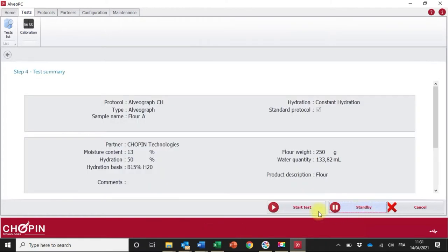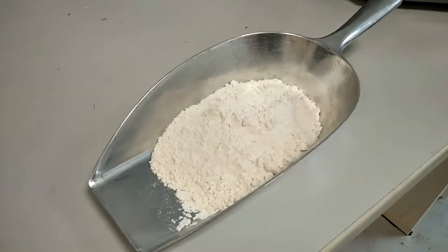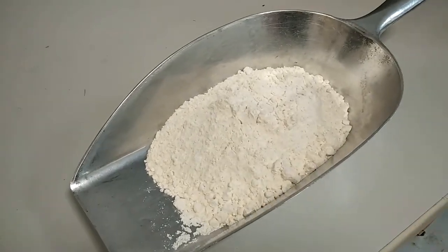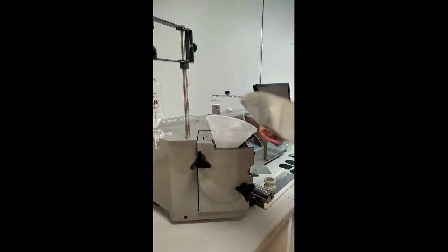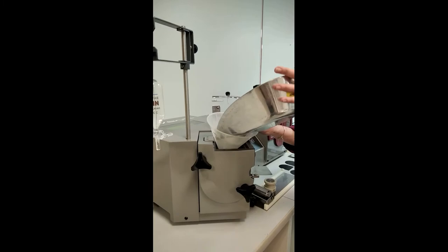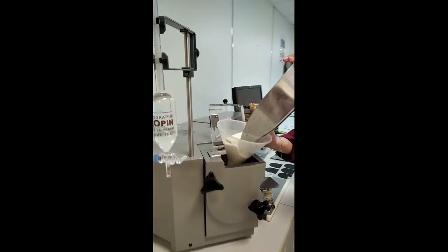Weigh 250 grams of flour to an accuracy of plus or minus 0.5 grams. Place the hopper on top of the mixing bowl and insert the flour.